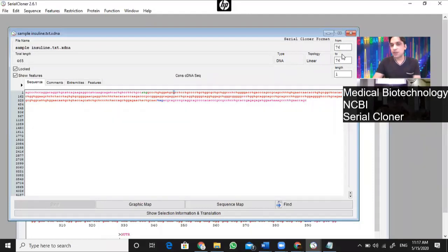And the tool is telling me it is base pair number 76. So what we should do is our own choice for learning. What should we do? Delete the base, remove it, or replace it? Suggest to me in the text box.